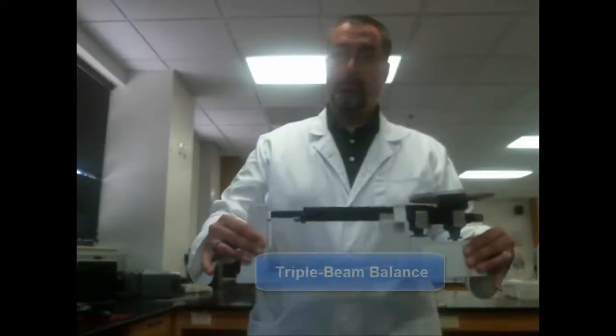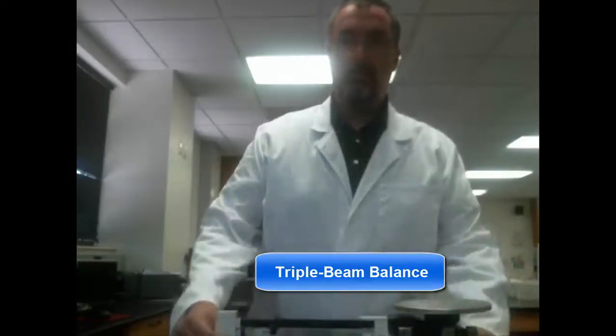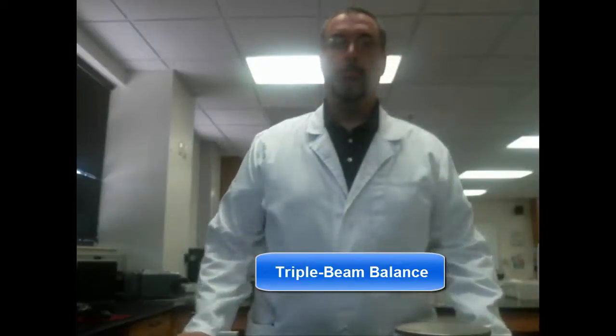One of the things you're going to need to learn before you can really get into measuring is to use certain devices and methods. For example, you need to learn how to use a triple beam balance. This is a slightly different way of measuring mass than you're probably used to. We've used digital balances before, but the triple beam balance is actually quite useful.